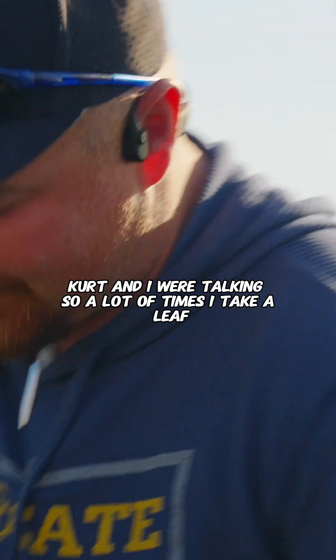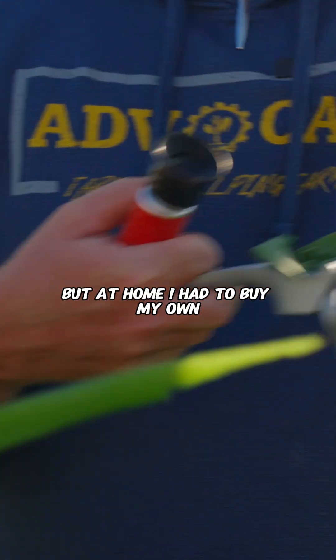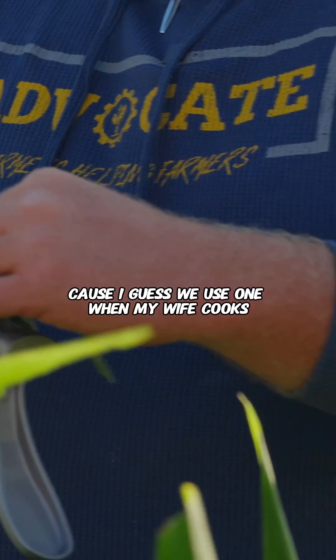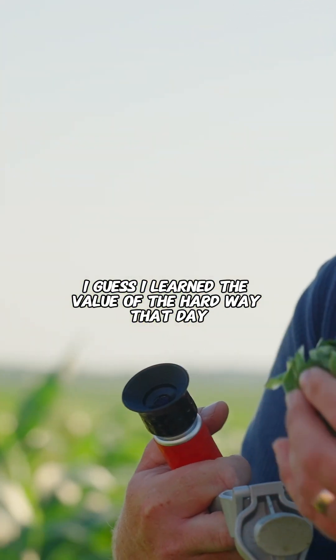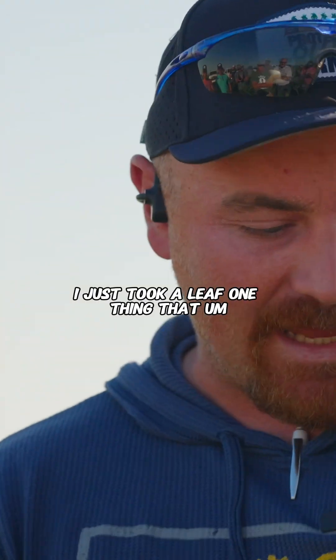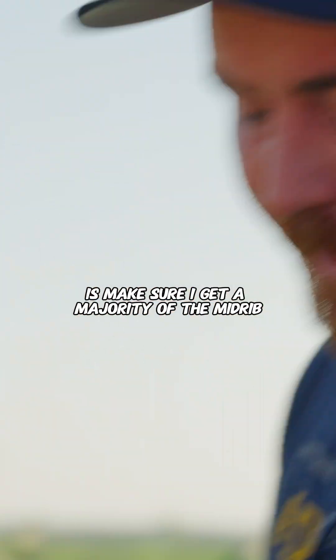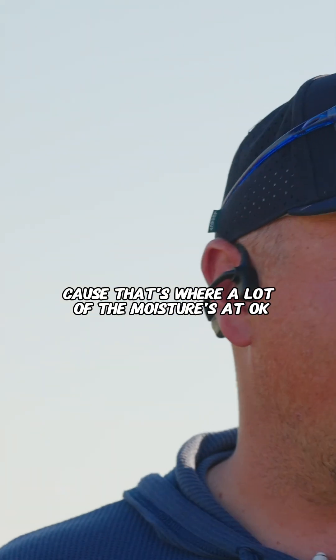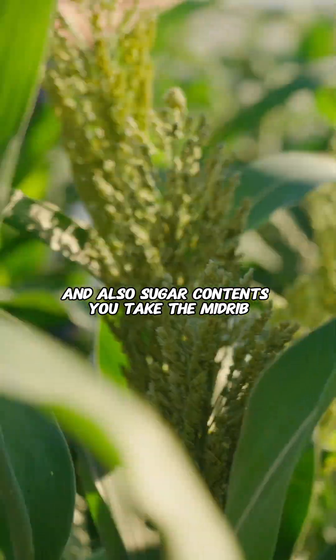So Kurt and I were talking. A lot of times I take a leaf — I had to buy my own garlic press, actually Kirk's, but at home I had to buy my own because I guess we use one when my wife cooks. Long story short, I just took a leaf. One thing I always try to do is make sure I get a majority of the mid-rib, because that's where a lot of the moisture is at, and also the sugar content. So take the mid-rib and put it in.